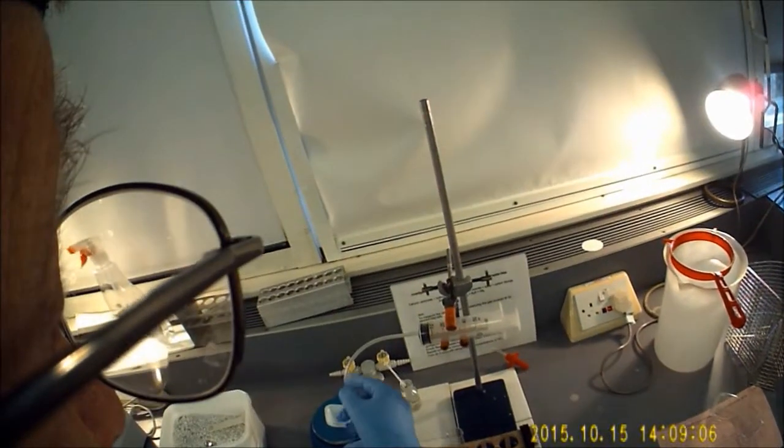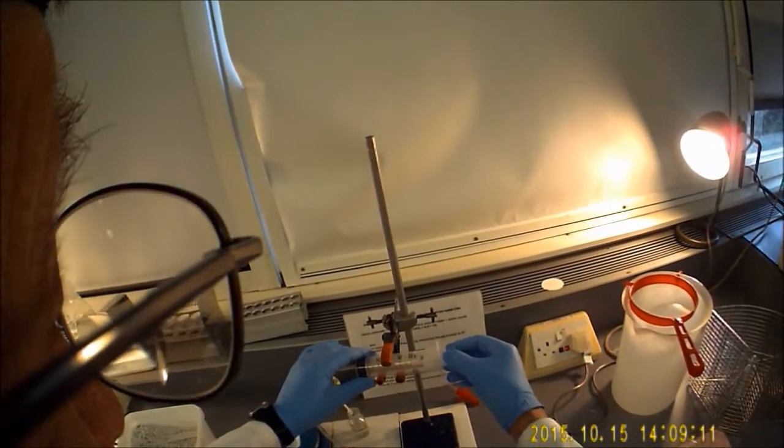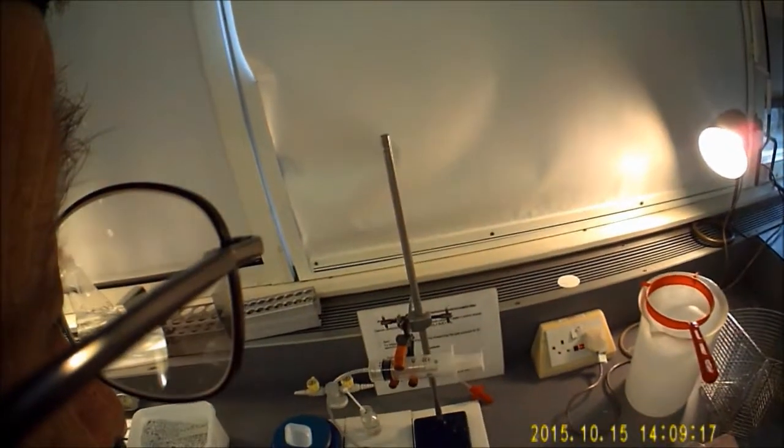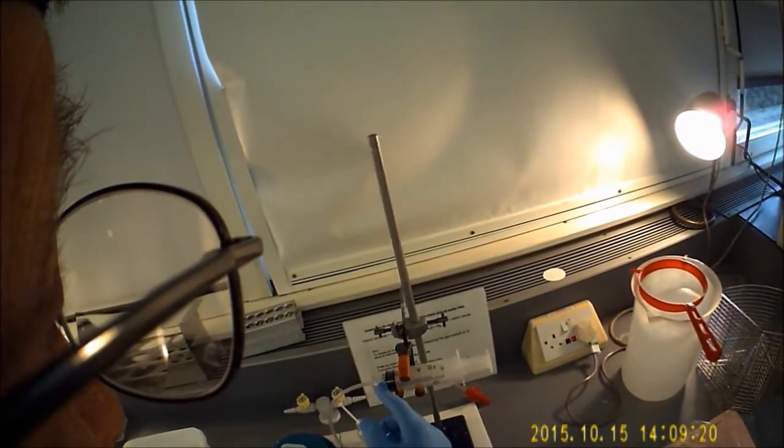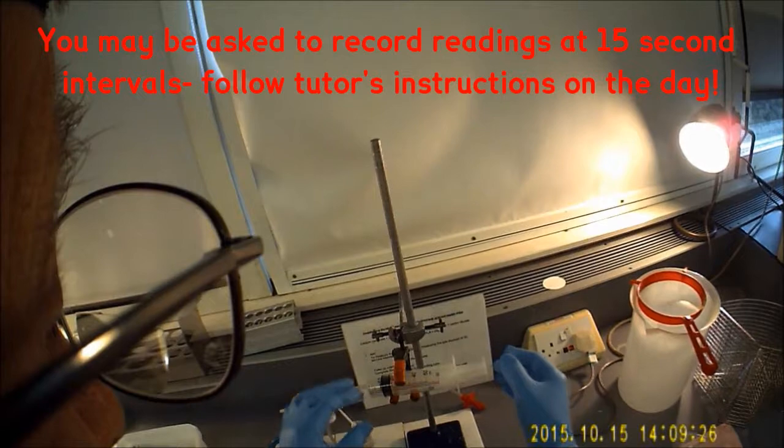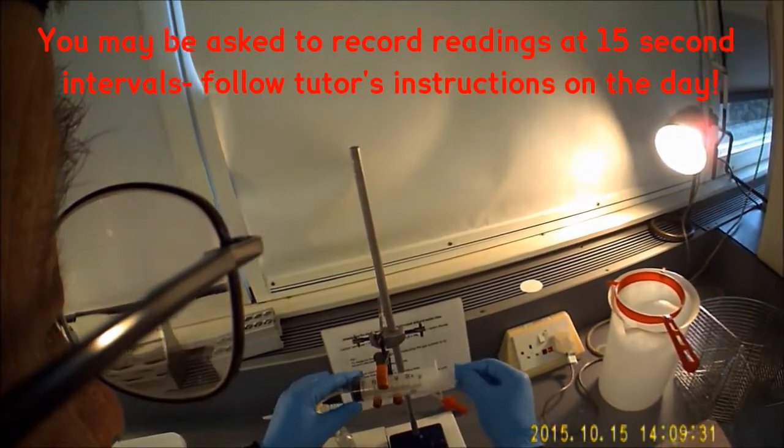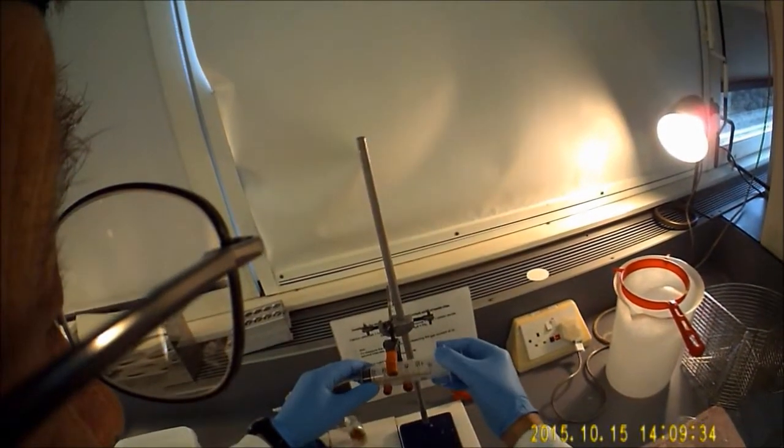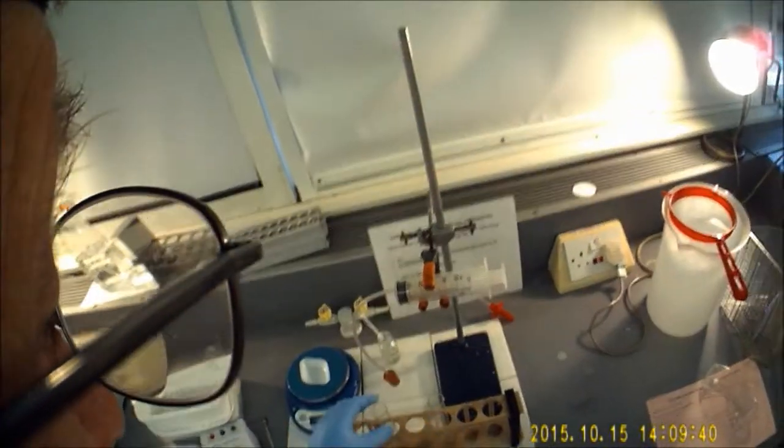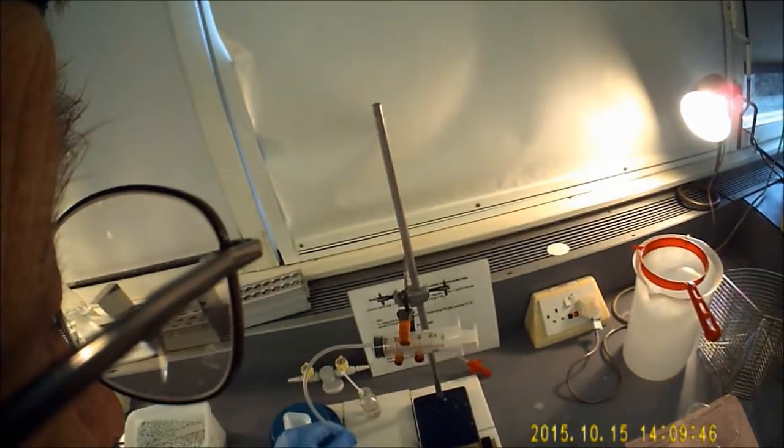It will then start to travel up the tube here and will force the plunger along, and what you'll be doing is measuring the place which the plunger has got to at 30-second intervals, and you'll continue doing that as stated on your lab sheet. So before you start, make sure the plunger is pushed right back, make sure the jaws aren't pinching the actual syringe, and make sure that the things actually fit without having to stretch the tube.